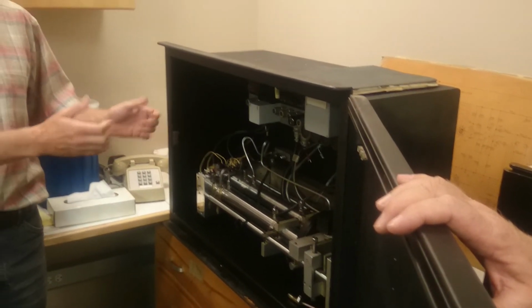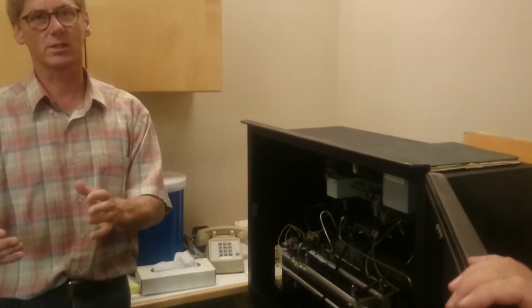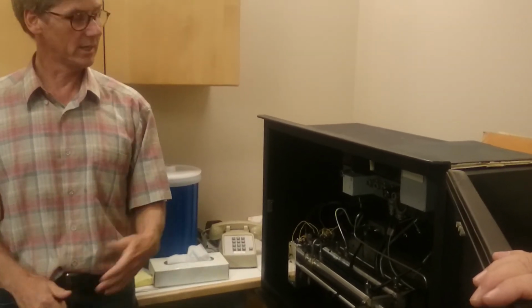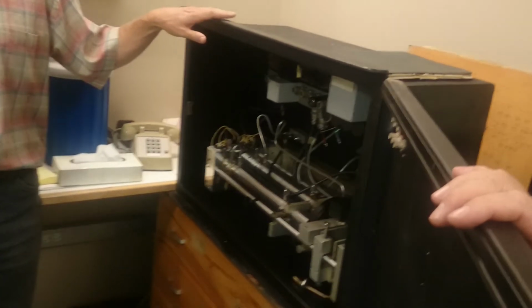It had never been used for measuring such low levels. 300 parts per million was kind of a small amount to detect. But he sort of worked the numbers and was bullish that it could work. And this company was willing to make 4 or 5 of these custom analyzers. They never built any more of them. Wow. But various other companies came in and built analyzers that became the more standard workhorses of the community. He stuck with these, and we were still using this up until a year ago.